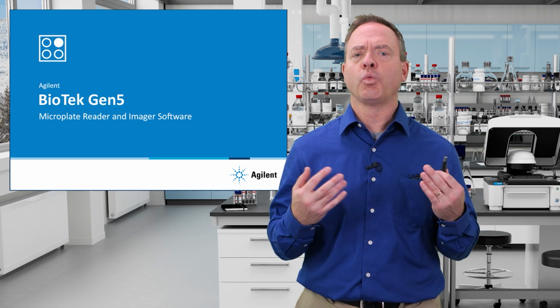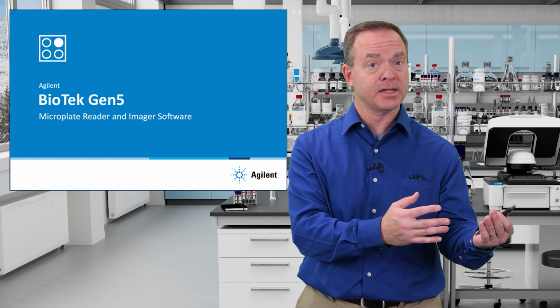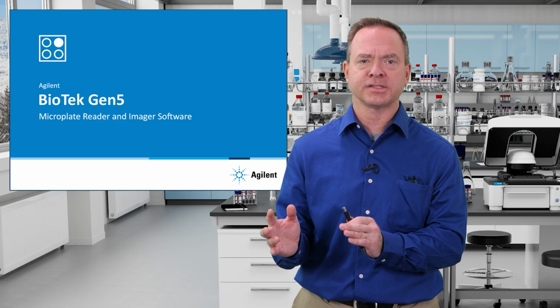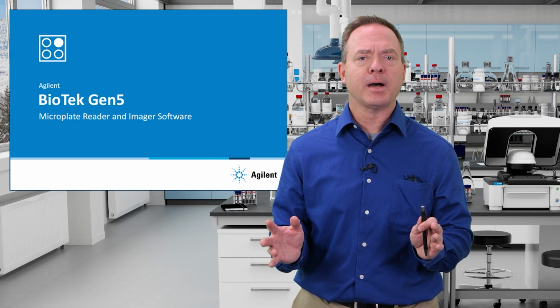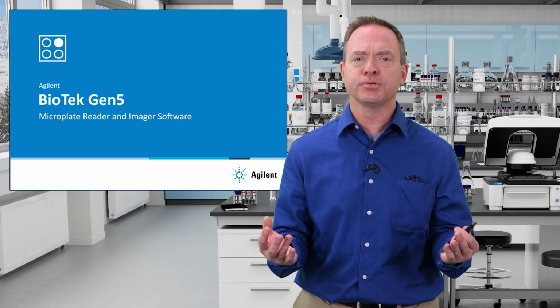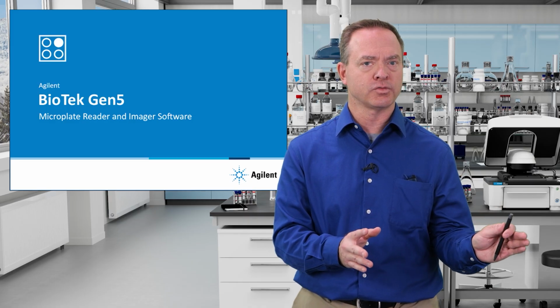Gen5 provides a wide breadth of methods to capture both PMT-based data and images, in addition to powerful analysis capabilities, thereby enabling a multitude of different life science experimental procedures to be performed without the need to incorporate other software.